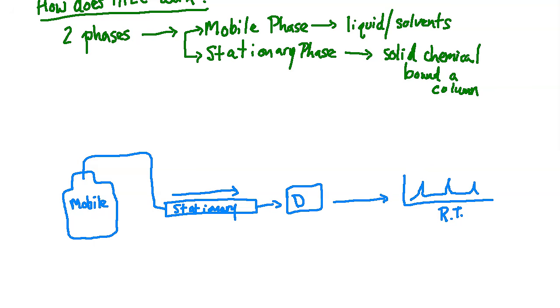All right, so a mobile phase is oftentimes going to be a mixture of water and organic solvents when we take a look at it. And the polarity of the mixture, or the lack thereof, because you could certainly be working with nonpolar ones as well, that will determine how long the compounds are going to stay on the column or adhere to the column, and that's known as retention time. And then the stationary phase, the columns are packed with different materials, usually some sort of organic materials, often applied to a silica bed, and those will bind to the compounds that are being separated and sort of spread them out as the mobile phase is going through doing its thing.